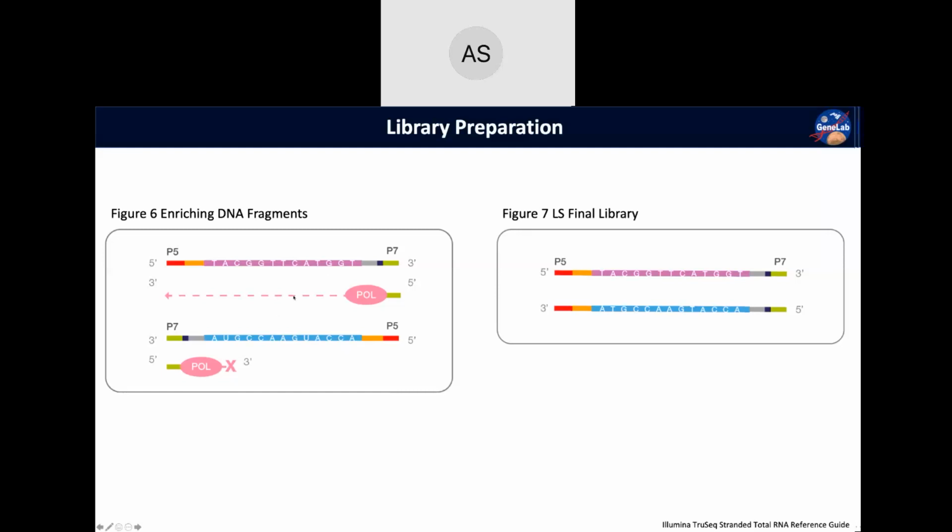And so if we had a gene that was really high abundance, so there were a lot of copies of a particular gene, when we do this amplification step, the transcripts that are more abundant have a higher likelihood of being duplicated during the PCR step, and maybe one of those artificial duplicates is going to be what's sequenced. Now we will have artificially added an extra sequence that we're going to quantify and say, oh, this has plus one sequence, when that wasn't the case biologically speaking. That's what I mean by a duplicate, and specifically a technical duplicate. Does that answer your question, Rashi?